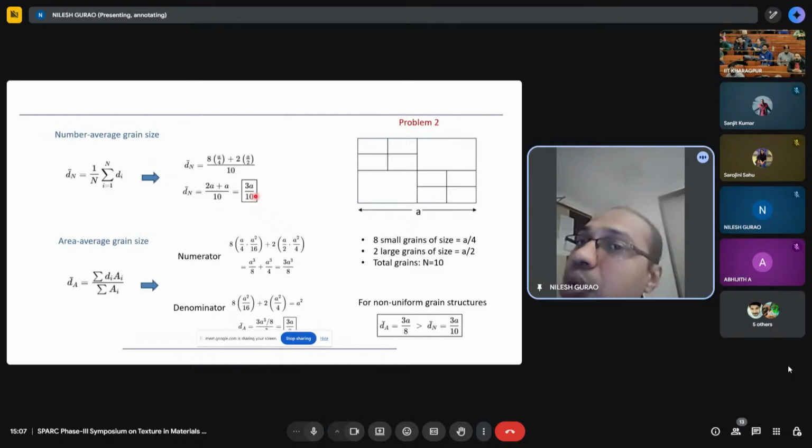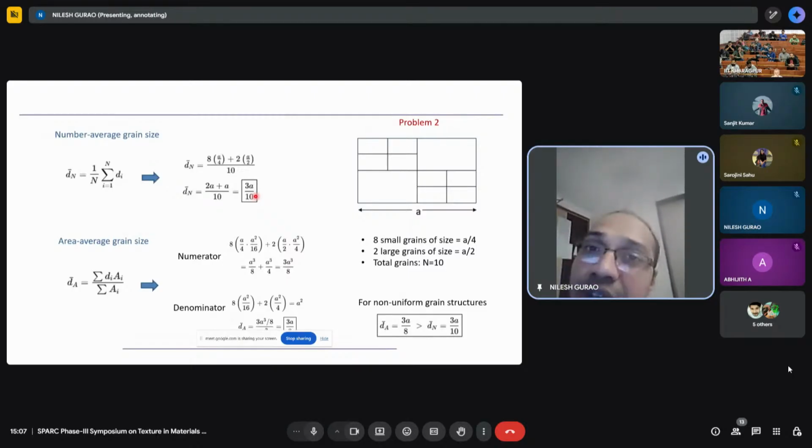So we talked about 2 things. Number 1, where to do EBSD, and then you come to the correct frame of reference, the step size to be chosen and all. Then the next thing is the grain size, to quote the grain size. Here one has to be very, very careful whether you are quoting area average, number average, vertical intercept, what is the aspect ratio, all these things.